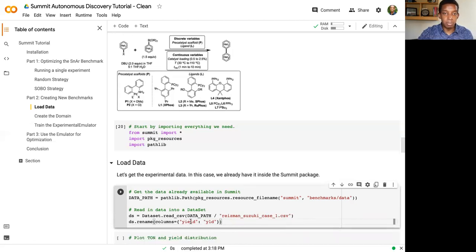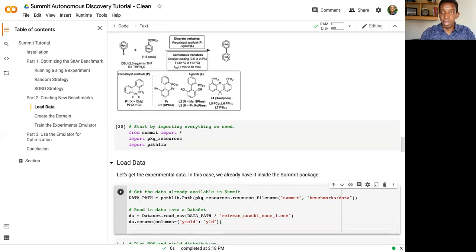If you name a variable yield, it will cause problems, particularly if you use that multi to single objective transform I talked about previously, because yield is a keyword in Python. It's a reserved word for asynchronous tasks, so you really don't want to use yield as a variable name. We should use something like YLD as an alternative. So I've just renamed that there.